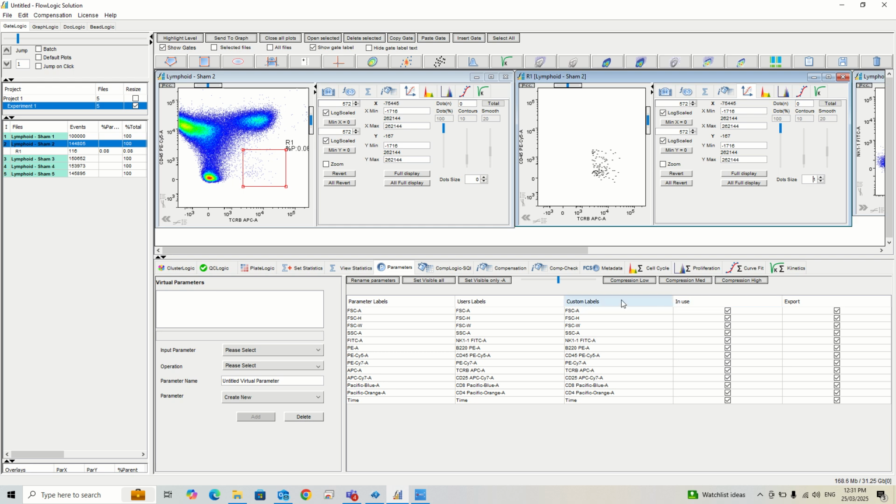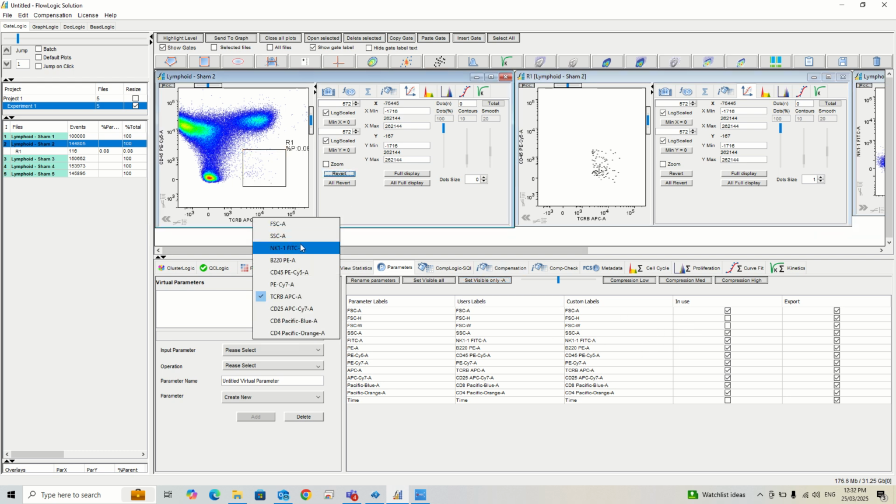Again, we have a beautiful improvement in terms of parameter. For example, usually we use just area. In this file we don't have many parameters that are not areas. But if we want to get rid of parameter or not area, say visible parameter area only. And then you can decide what you want to see, because here you can see the reduction. We have just area parameters.